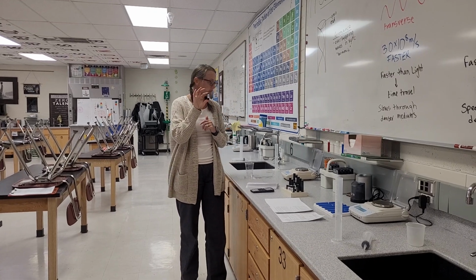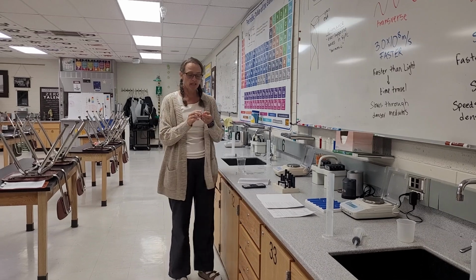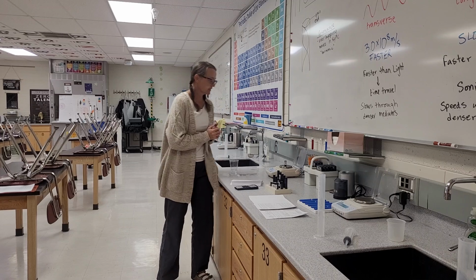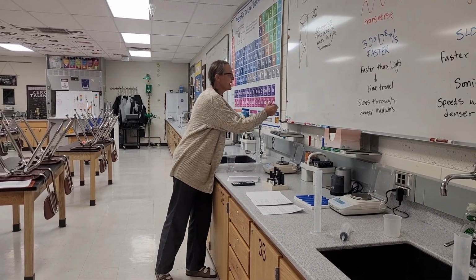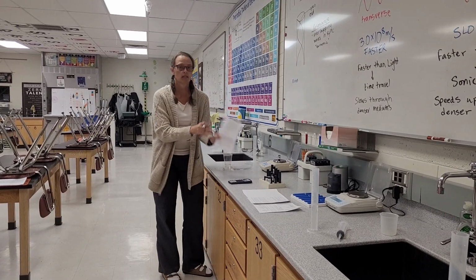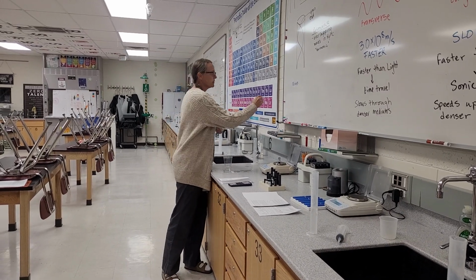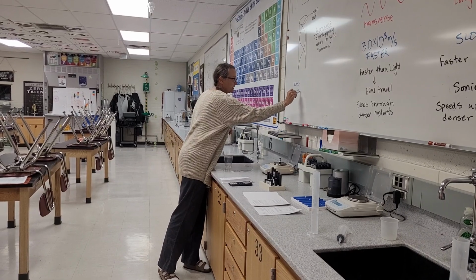So I'm going to get my little object. I'm going to make sure it's dry. If not, roll it on your pants. Do whatever you got to do to make it dry. Put it on your electronic balance, and then you're going to record your mass in your little book. Okay. So it has a number on it. So whatever the number is, record the number and the mass for that number.